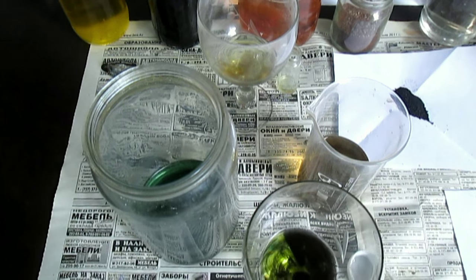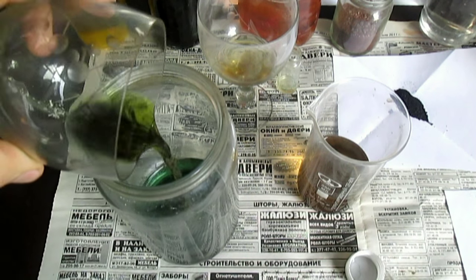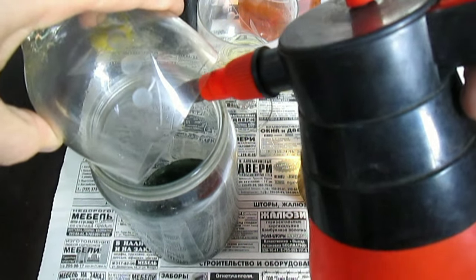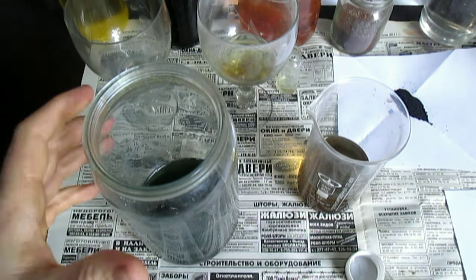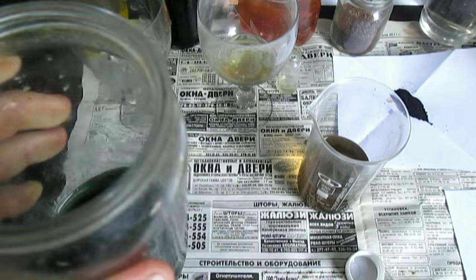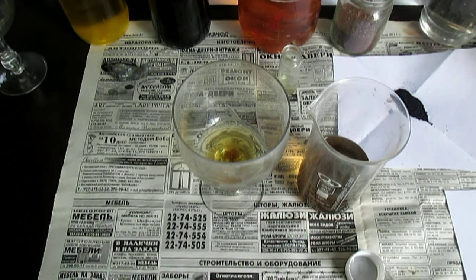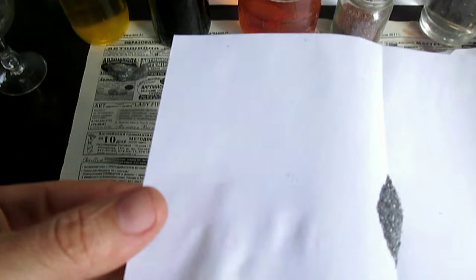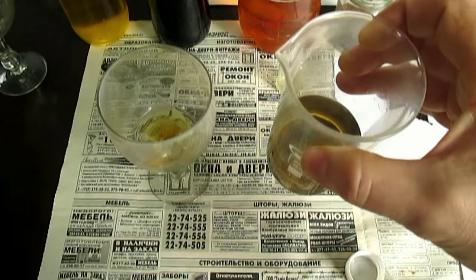Убираю сюда вот. Это с одного процессора, где-то, золото. Потом это я буду перерабатывать — когда буду перерабатывать те радиодетали. А из этого раствора буду выделять золото при помощи порошка. Я уже подготовил. Сюда насыплю, и золото выделится отсюда, так же как и вот отсюда.